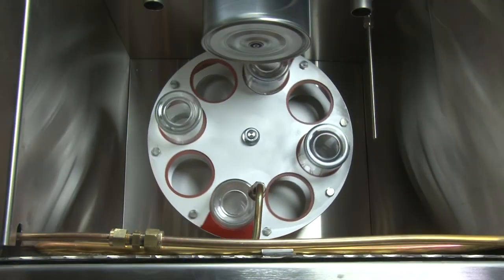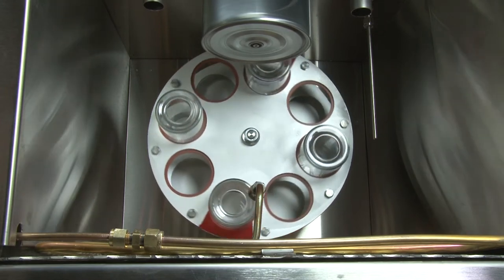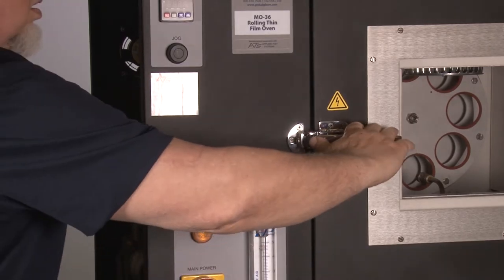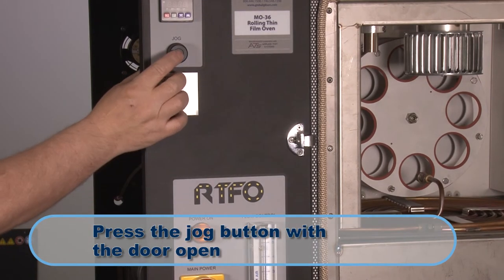The carousel should rotate continuously in a clockwise direction during operation. If the carousel will not rotate and the door is closed, confirm that the RTFO is turned on, then open the unit's door and press the jog button with the door open.